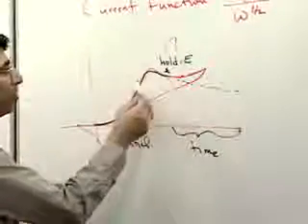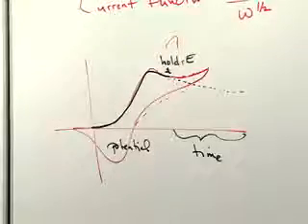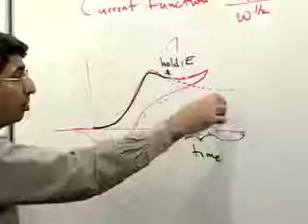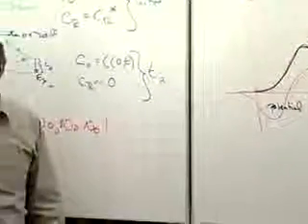And now you see, just by folding that over, you have a wonderful baseline. So you're no longer applying the... You're holding just this potential, whatever that last potential is. You're not turning it off, but you continue, and you get the Cottrellian behavior at that potential then. Okay. That's a great way to do it.